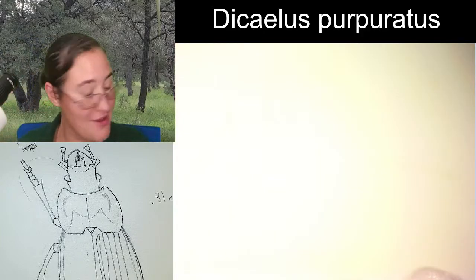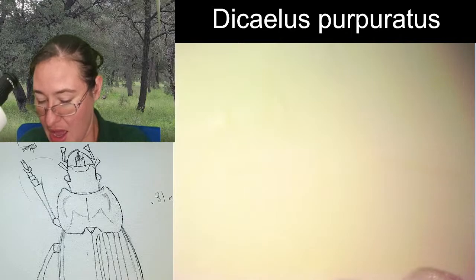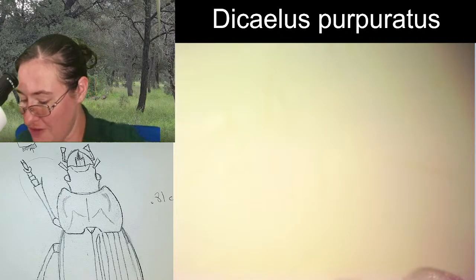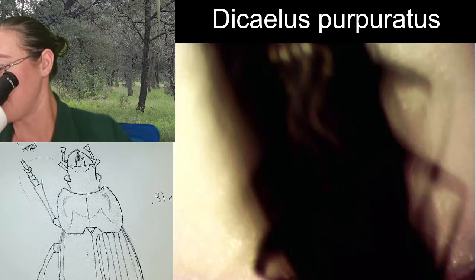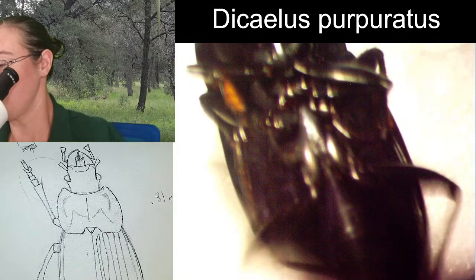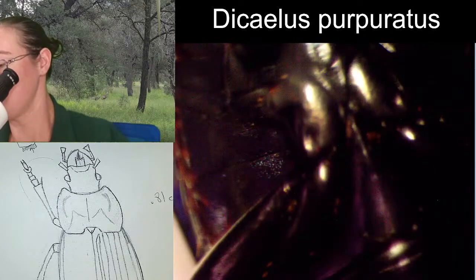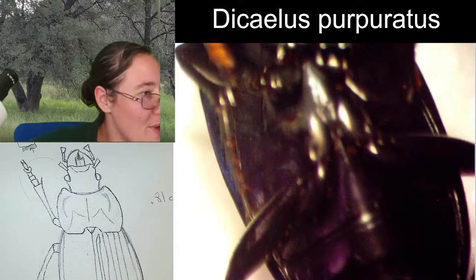So, we haven't drawn the antenna yet. We've got to do the antenna really quick. And I just took off the labels because I want to flip this specimen upside down and look at the trochanters. There they are. I don't know if you can see them very well. Let me see if I can.